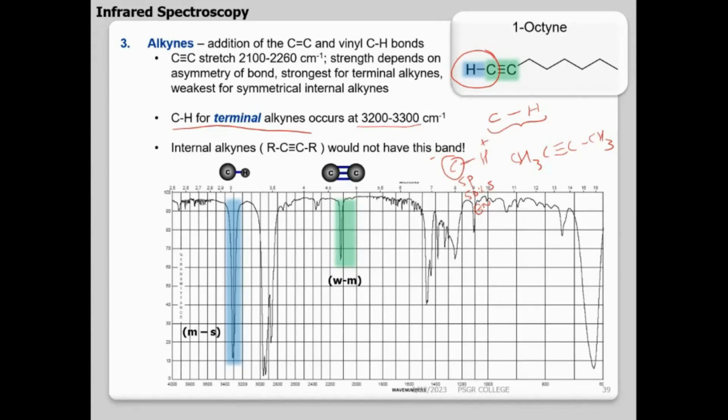But the point we are talking about here is that OH and NH are all there, but the application of this particular point is that I can easily talk with respect to the charge separation. Always I can talk with respect to the charge separation. So these peaks will be very intense. CH peak, OH peak, NH peak will be highly intense because of this charge separation. Why do you say acidic?